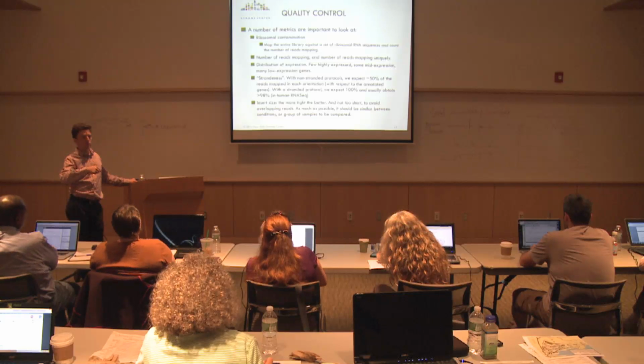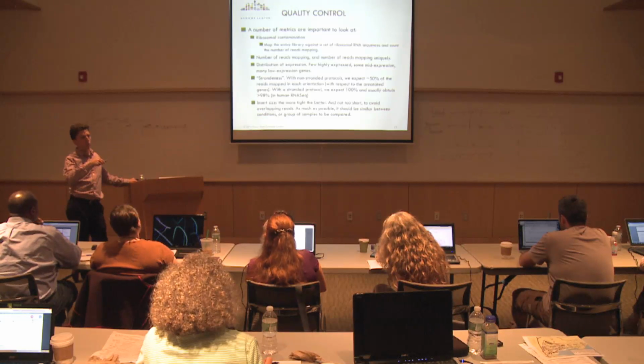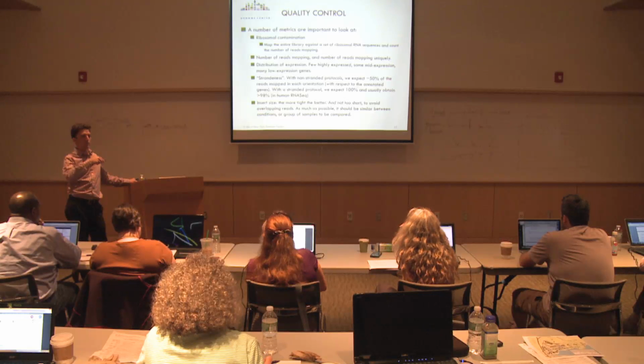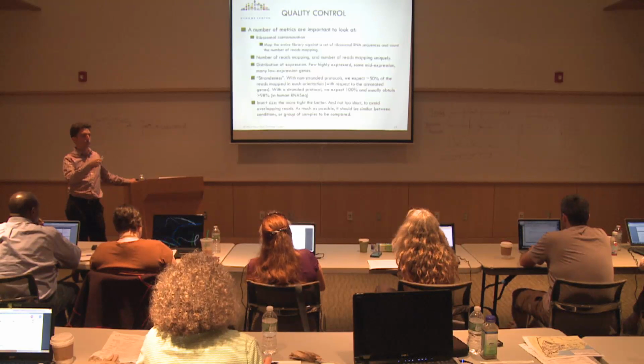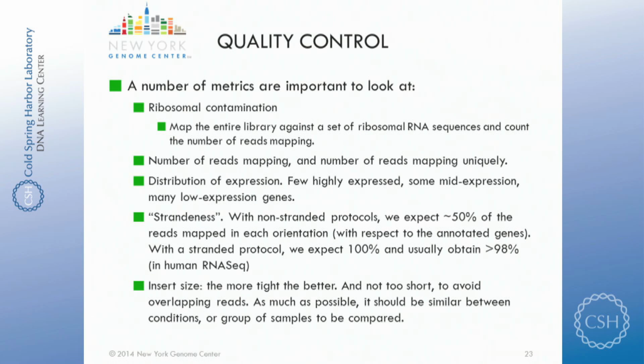And importantly, within the same sample or same project where you have multiple samples, you probably won't expect to have a large difference in the ratio of the number of reads mapping to the genome to the total number of reads, right? Except if you have good reasons.